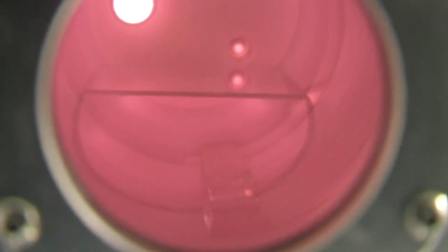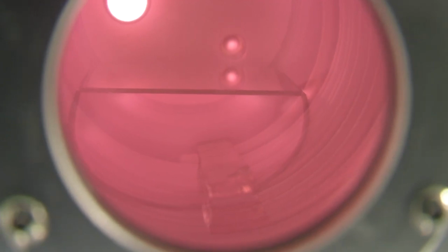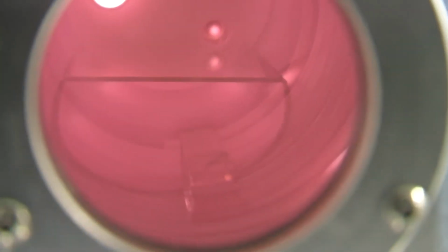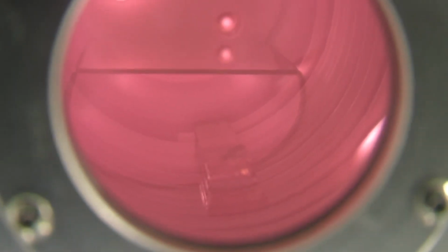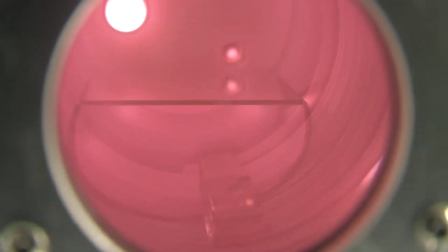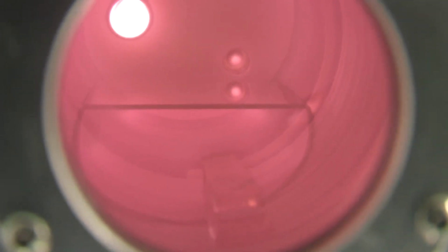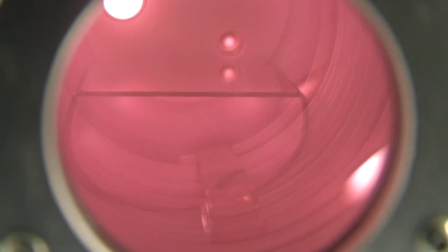So now we are looking at the plasma. It is at 65 watt power. You can see the glass slide and the PDMS membrane inside soaked in the plasma. We need to do this plasma treatment for like 5 to 10 minutes. After that we will take it out and see how they are bonding. Okay, you can nicely see the pink color plasma bathing the slide and the PDMS membrane inside. So after 5 minutes we will take out these two and try to bond them.